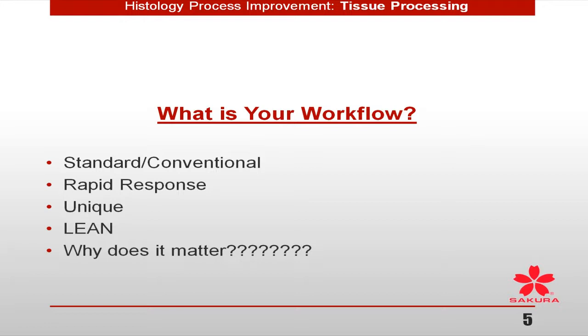There's issues with that today. Again, with the increased specificity and the different types of techniques we want to do, do you see the variation that much with your H&Es? Maybe, maybe not. But in your performance of some of these more specific tests that you have, yes, you start seeing variation. And then it doesn't necessarily mean that you have a problem with processing. Your processing may not be specific enough for what you do.